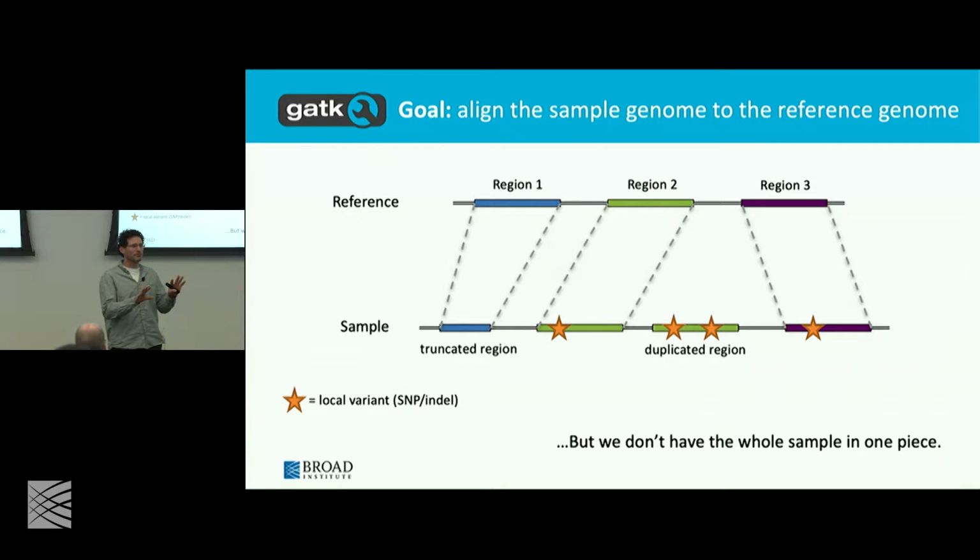We might have some filters that will be able to sniff out that something is weird. The allele balances are off. There's all kinds of strange results. There's things that look like mapping artifacts. There's certain smells of this thing happening. But in order to absolutely know what's going on, you need to run a copy number tool. We have a copy number suite of tools that you can run, and it will tell you, oh, there's a copy number here. And then we actually don't have yet a good answer for what do you do next.